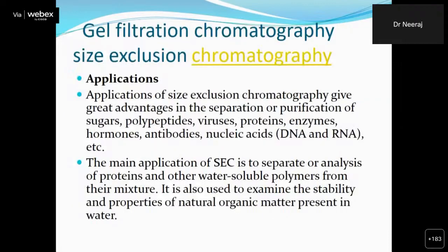So gel filtration chromatography is called size exclusion chromatography. The application of size gives great advantage in the separation and purification of sugars, polypeptides of different sizes, viruses, proteins, enzymes, hormones, antibodies, and nucleic acids, DNA, RNA, etc. The main application of SEC, gel filtration or size exclusion chromatography, is to separate or analyze proteins and other water soluble polymers from their mixtures.